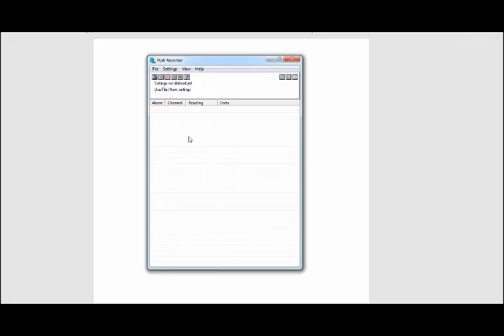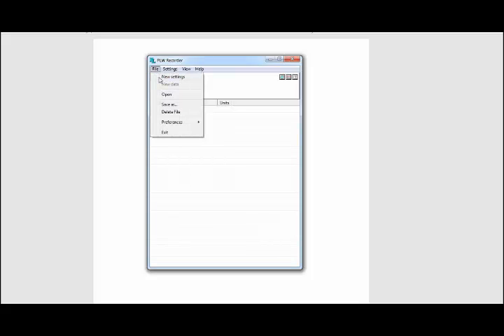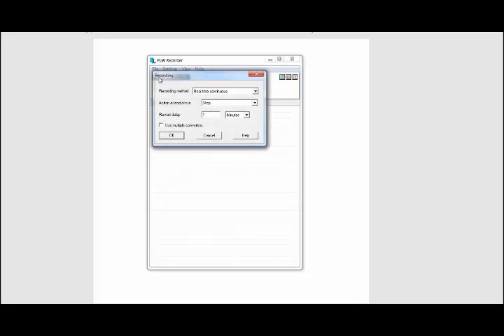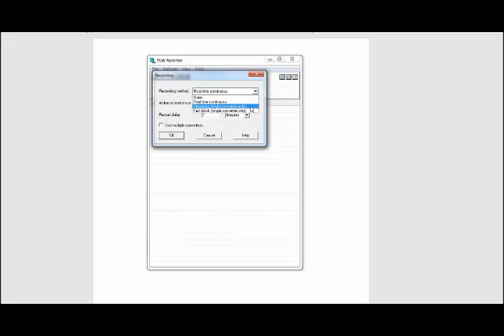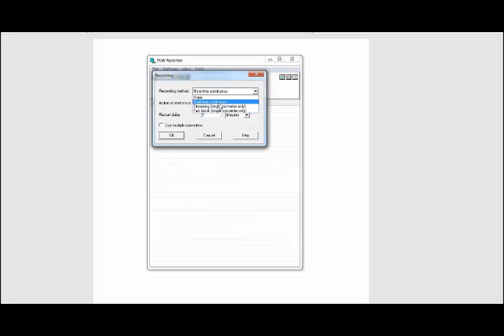Now what we need to do is initiate some new settings for both units. In order to do that, we're going to go up to File and click on New Settings. Recording method here will be Realtime Continuous. On some of our other devices you can do streaming or Fast Block, but for the TCU8 we'll want to use Realtime Continuous.